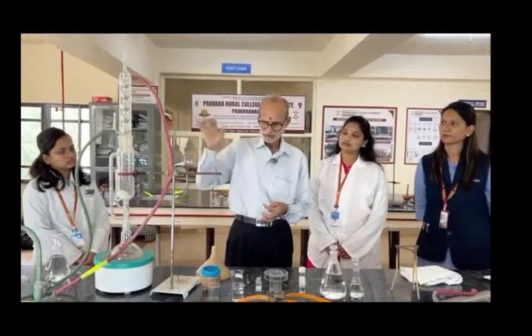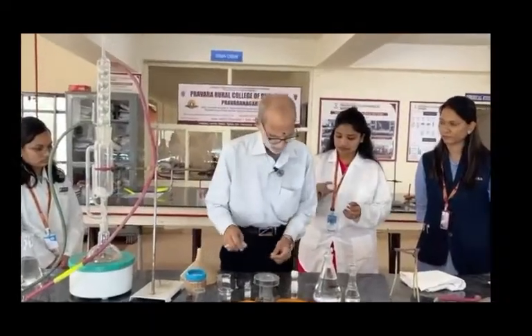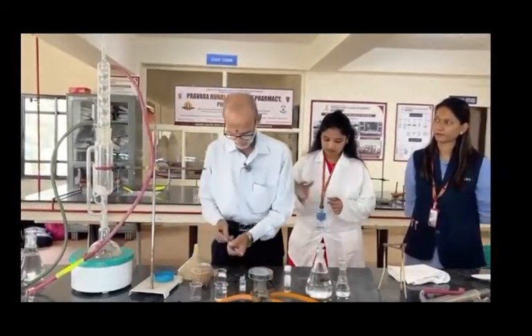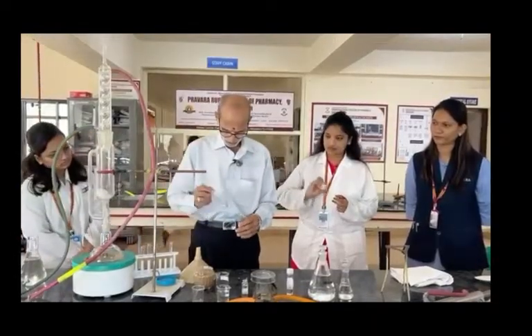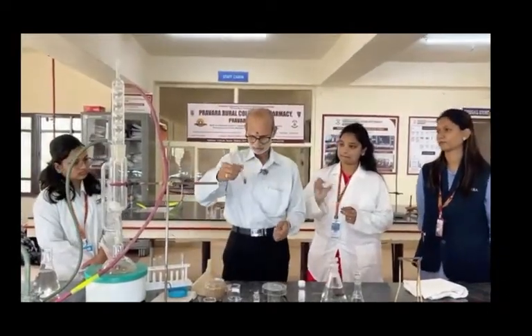Now we are ready with a standard solution in methanol. This is a standard embelin. Just shake it. Whenever you undertake extraction and isolation, the first and foremost important thing is that you must confirm the raw material which you have purchased. This powder we are going to extract with methanol, and then test it by either a chemical test or by thin layer chromatography.